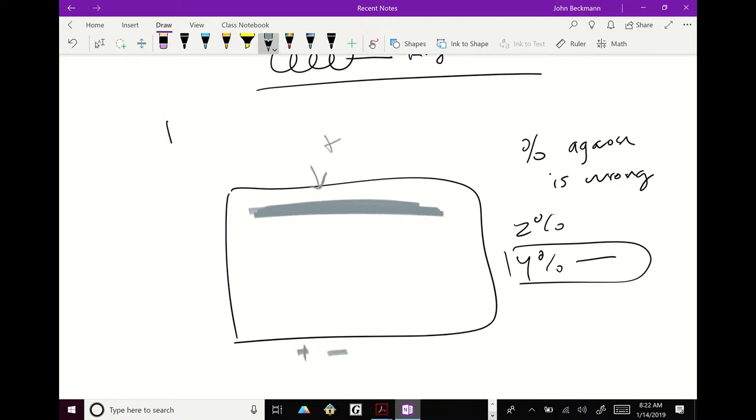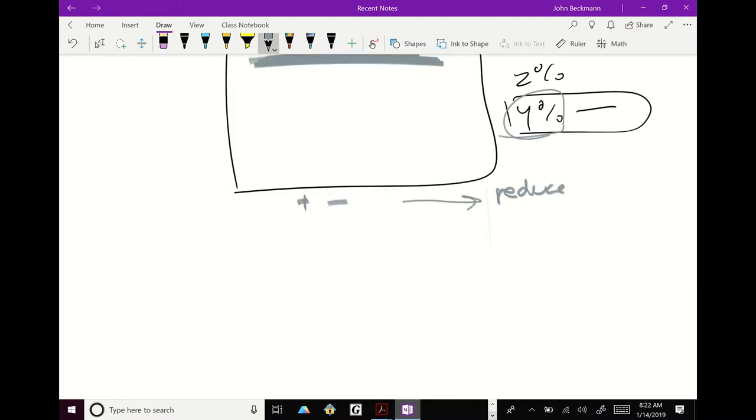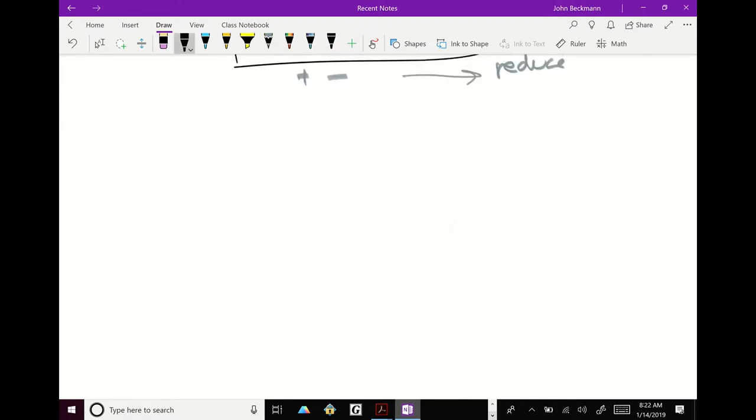Does that make sense? So in that case, because you did your positive and negative control, now you know, looking at that data, oh, I know what I need to do. I just need to reduce the percent agarose to make it visually separate out so I can actually visually interpret the data. Does that make sense? Does that clarify? Okay. Good question. I like the questions. Okay. So that's basic agarose gel stuff.